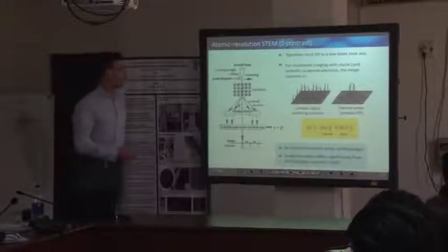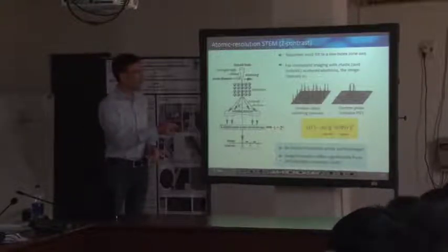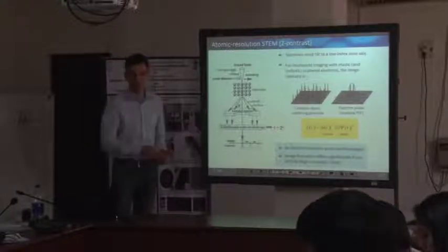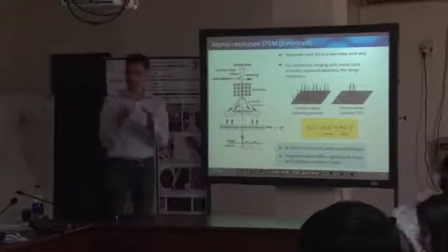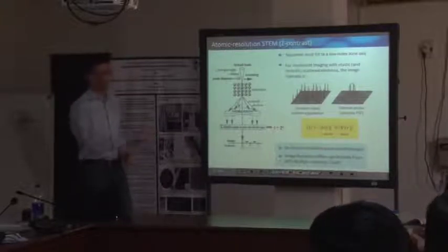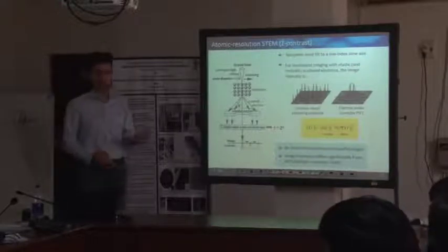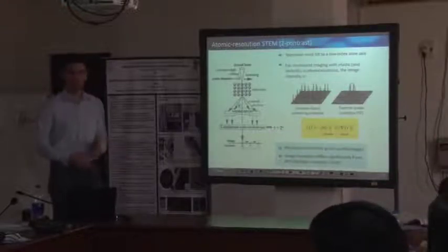This is how this imaging process works. In principle, we have the distribution of our local potential due to these atomic columns along the zone axis direction, which are very fine. Depending on the size and shape of our electron probe, currently in first approximation a Gaussian-shaped probe with a certain width, this is just the convolution of this potential with the shape of our probe. There's nothing else behind it. So the smaller the probe, the better the resolution in our atomically resolving STEM image. So the resolution is limited by the probe profile and the probe size.